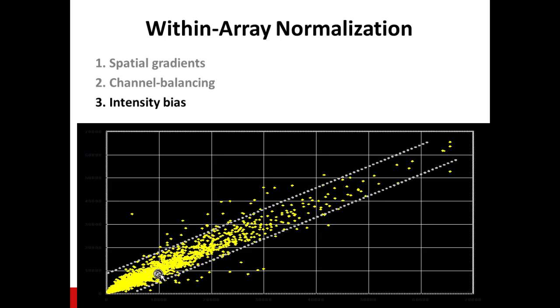So we have variance that's proportional to our signal, and there's a need to do what's called variance stabilization so that we're able to make accurate inferences. And that's really important if we have a gene that goes from very highly expressed to very lowly expressed, like deletion of a tumor suppressor. If we do not, then we have strong heteroscedasticity, which will be important to account for in our statistical models, and we have this unequal noise characteristic that even makes the next stage of normalization difficult.